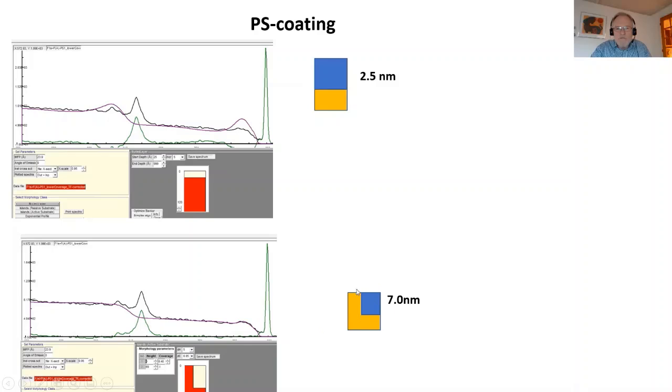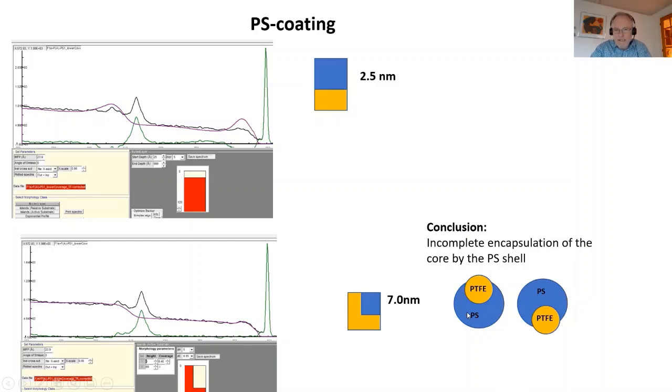So this is the structure we find, and when we interpret that, again, it's like this. Part of the surface is uncovered, so that means that the core is sticking out. It's not covered by the coating. And again, we'll be looking at the different directions. So this is what the individual coated nanoparticle looks like, with different orientations. Part of them will look like this, and part of them will be rotated 180 degrees, and we'll see the larger thickness here.